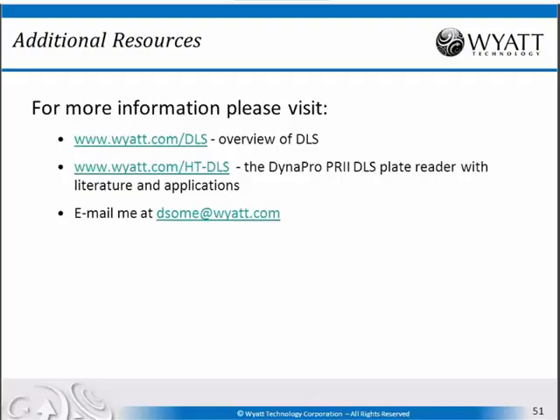Thank you very much, Dr. Sohm. We have a lot of questions, so let's get started. Peter asks, can this instrument detect IgG dimer versus monomer if you're looking at 300 kilodaltons versus 150 kilodaltons?